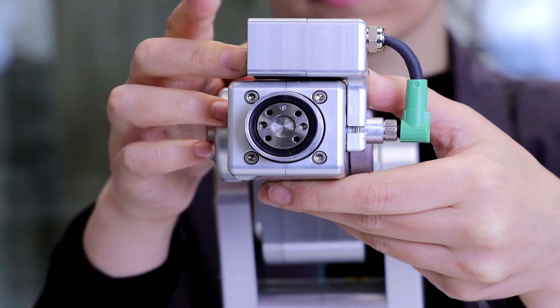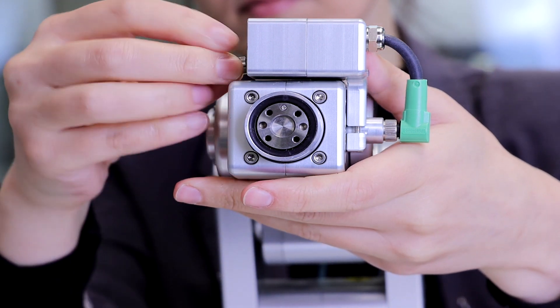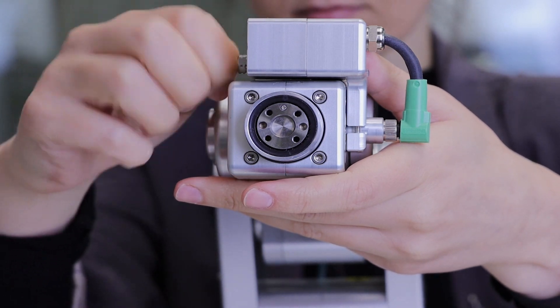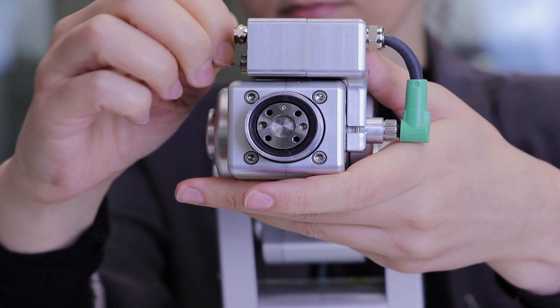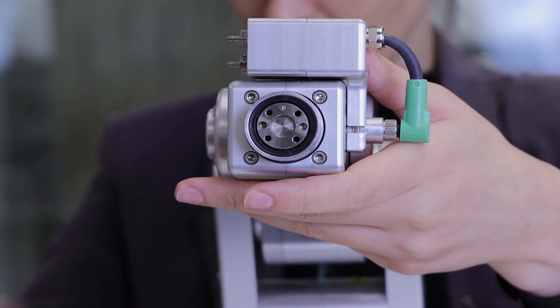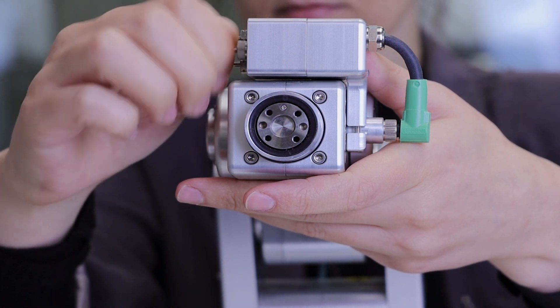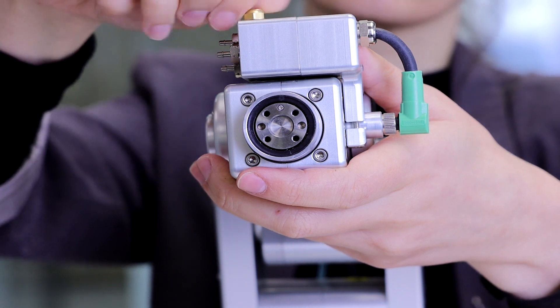The module has four M5 threaded pneumatic ports. If needed, install the barb fittings or the push-to-connect fittings on the pneumatic ports located on the side of the module. Install the pneumatic silencer if needed.